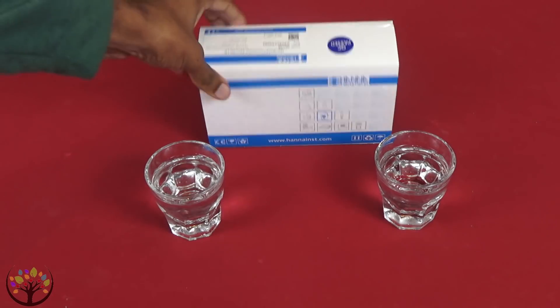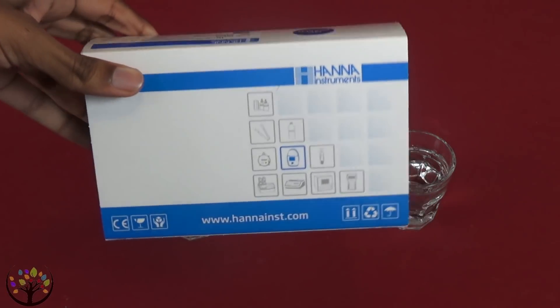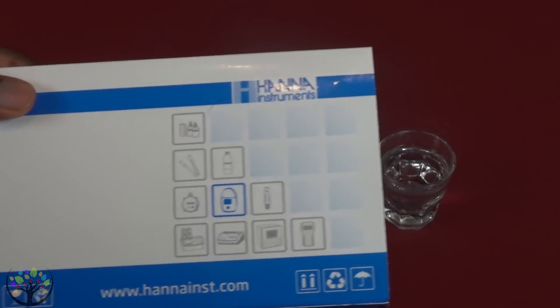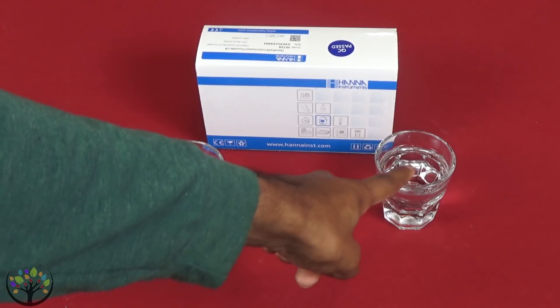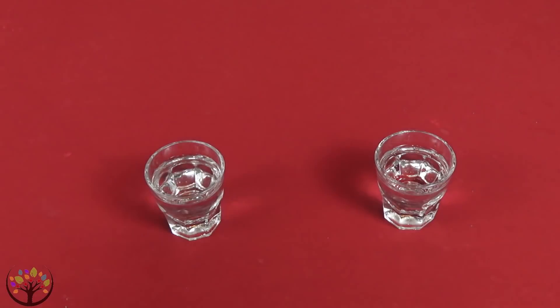This is a Hanna fluoride handheld fluoride tester and it was about $50 — not super expensive. Now on this side we've got the tap water and on this side we have the sun energized water. So we're going to go ahead and open this thing up, look at the instructions, and start testing.